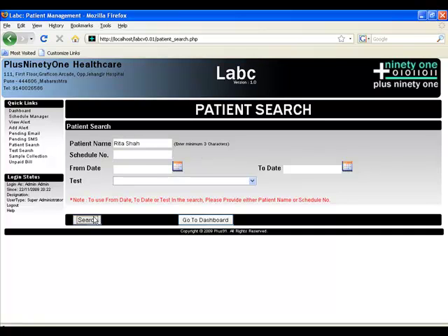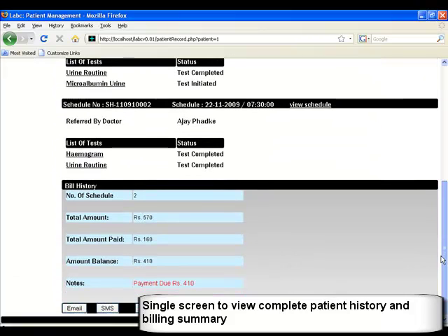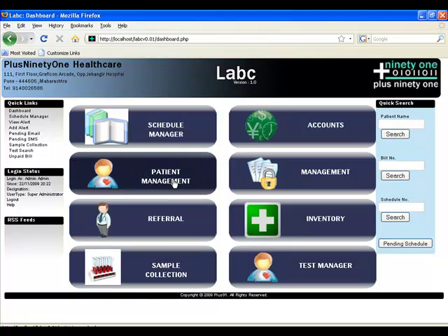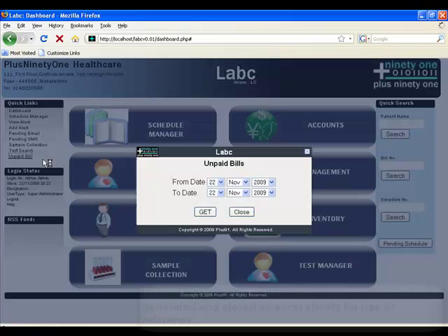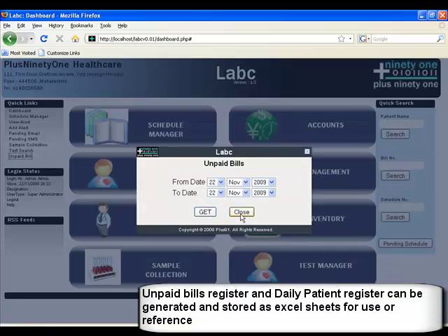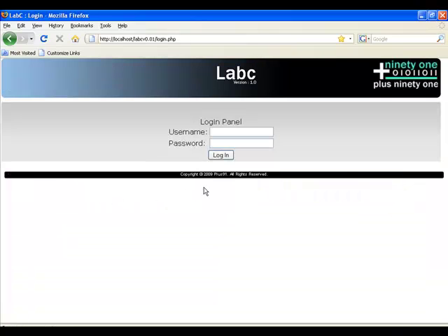You can view the patient history by clicking on a name, searching by schedule number, and other aspects — you will see the complete history of the patient, including all test history. You can click on a particular test to see the report. The sample collection module also allows you to directly manage samples, with a quick search option, a pending search option, and a pending schedules option to see all incomplete schedules. Unpaid bills is a report or Excel sheet which shows which patients have not paid their bills. Thank you for this demonstration of LabC.